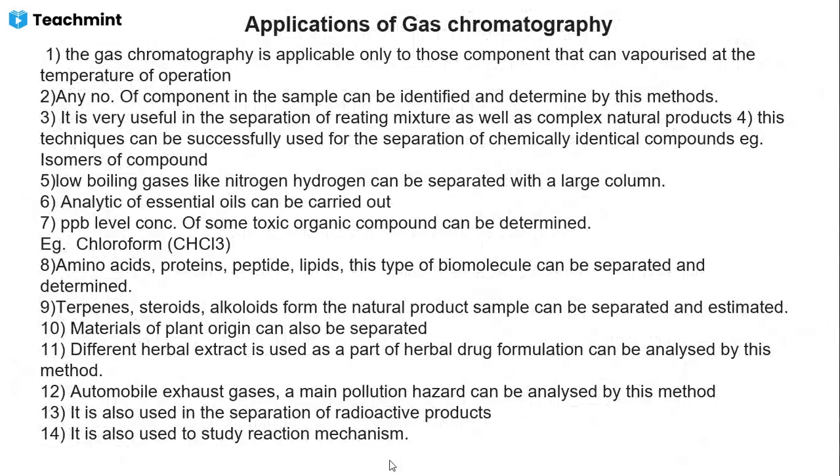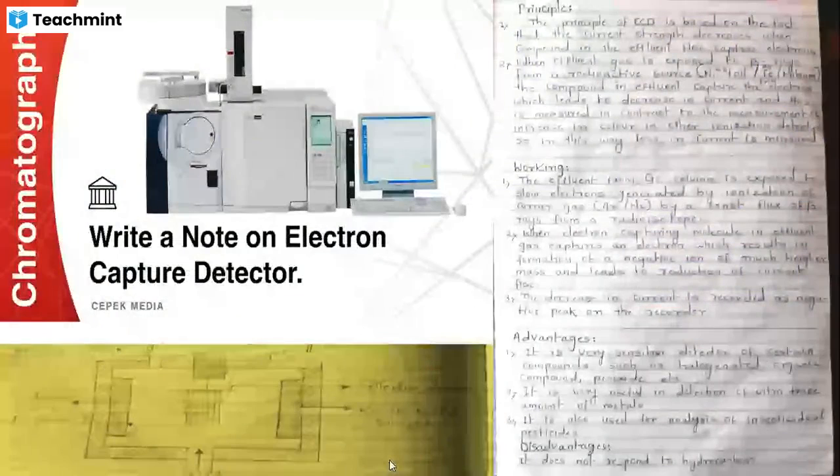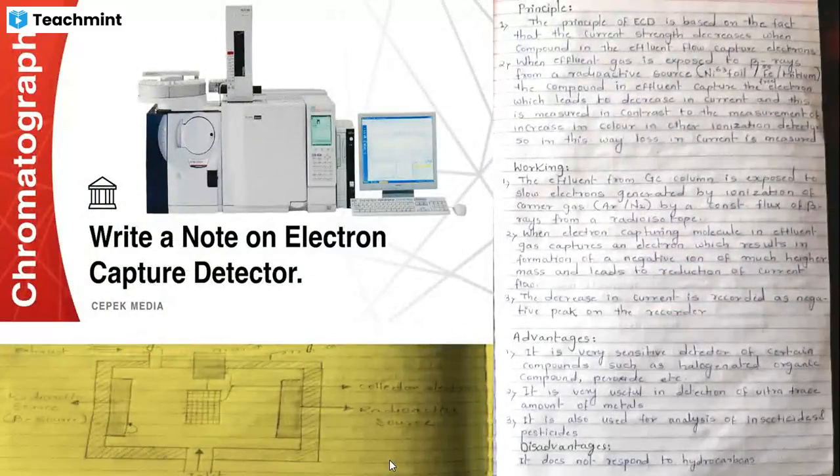There are a lot of applications. Whatever you remember, you can write. Okay, this is all about gas chromatography.